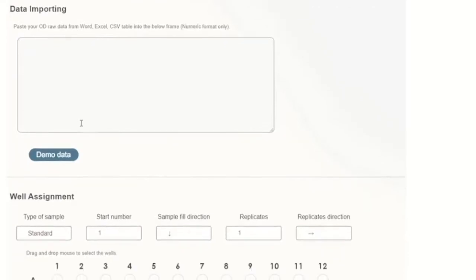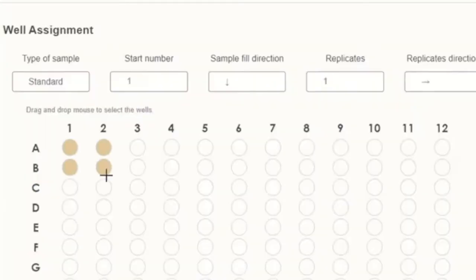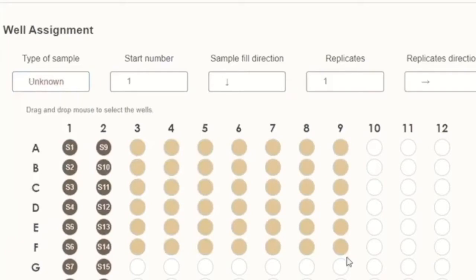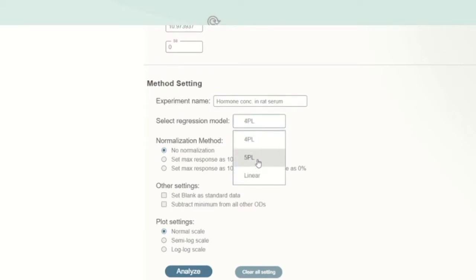In Arigo's ELISA calculator, you place the raw optical densities obtained for the standards, and it shows where they fit in the well layout — you can see the standards are placed correctly. You then assign which wells are standards and which are unknowns, and indicate whether replicates were done in duplicates, triplicates, or quadruplicates. After entering your experiment name, you select the regression model — four-parameter logistic, five-parameter logistic, or linear regression. For ELISA data you definitely use four-parameter logistic.